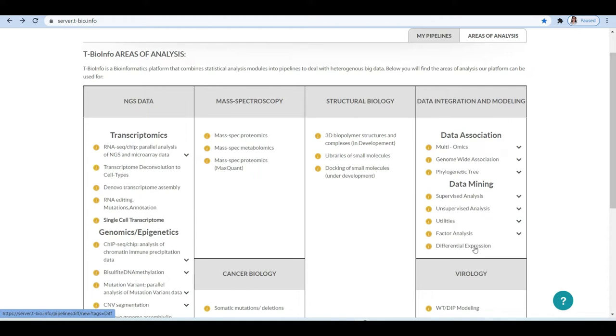Now, let's learn how we can apply the DSEC2 pipeline and perform enrichment and GSEA analysis when we have a gene expression in the form of raw count or read count values.